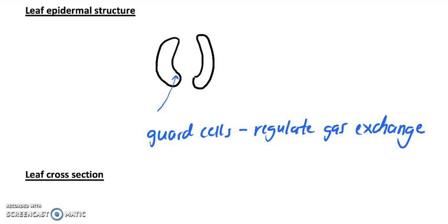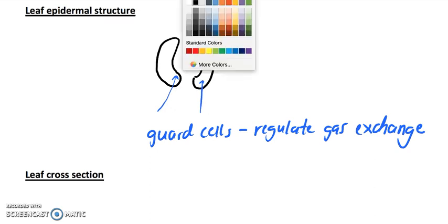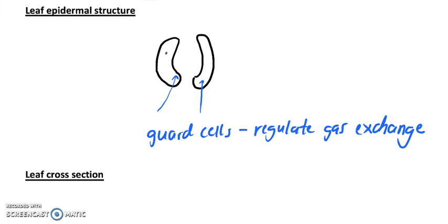These are your guard cells. Inside your guard cells, you might see a nucleus, and you'll also see little chloroplasts. Most cells have a nucleus, and this cell is no exception. And then we have our chloroplasts.